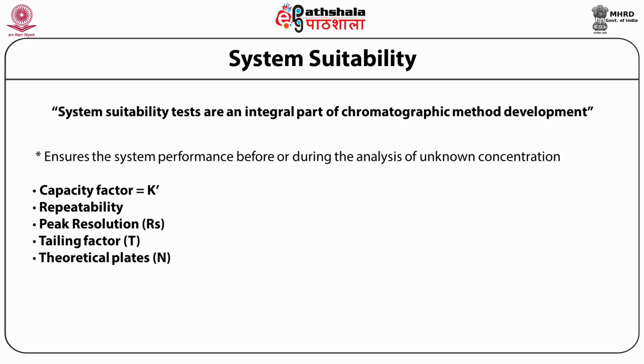By the time of method validation, you must have already spent a lot of time on that work. Finally, if they are not fitting well, you have to completely redo it. Therefore, it is important you do the system suitability test before you go for complete method validation in HPLC.